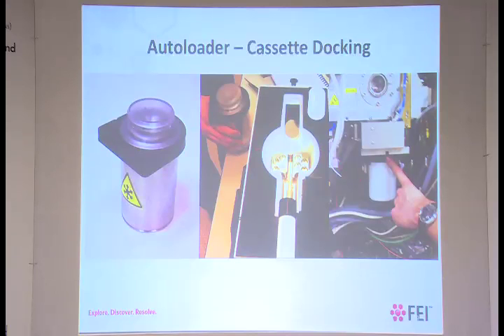We then have this tool to put that cassette with the loaded grids into this device here, which is called the nanocab. And this kind of cup will then go onto our system here. So you have your grids in the cartridge, and now they get positioned in this cab, and the cab now gets positioned into the microscope.